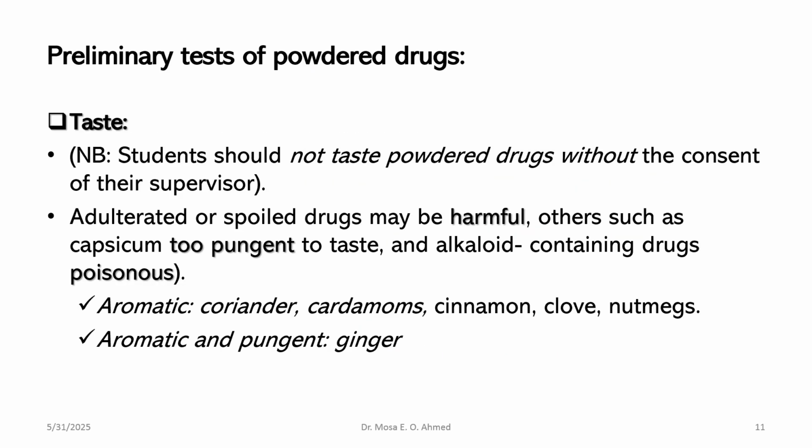Also, a third important morphological character that can be noted for powdered drugs is their taste.